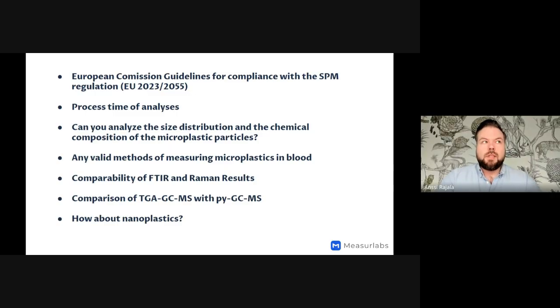Even a microparticle in micrometers usually consists of several different polymer molecules, so the molecular size is not a thing that affects the limitations or detection limits much. It's the particle size that is the limiting factor usually.